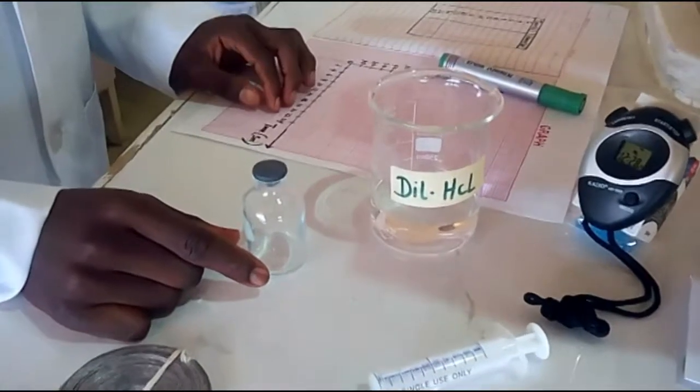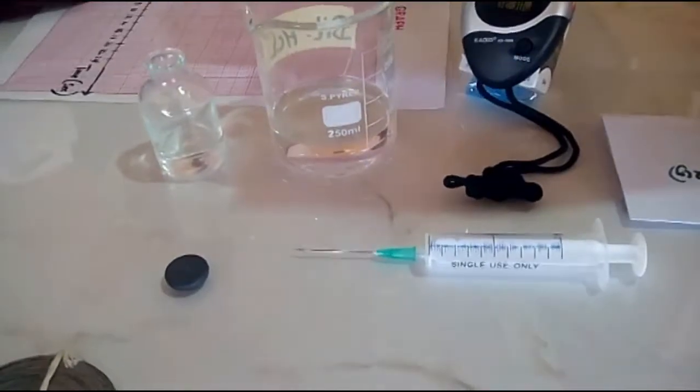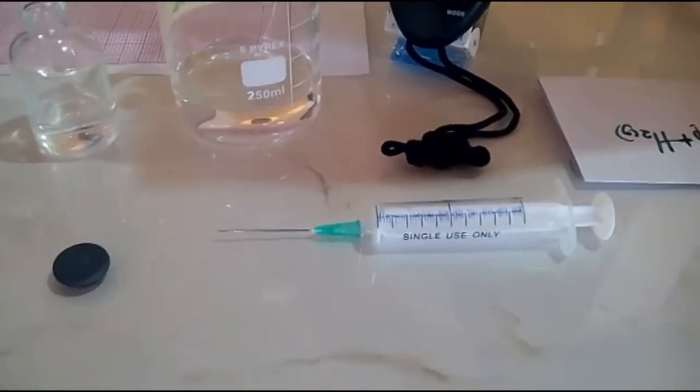Procedure. Step 1. Fill the reacting vessel with dilute hydrochloric acid. Step 2. Insert the gas syringe through the lid of the reacting vessel.